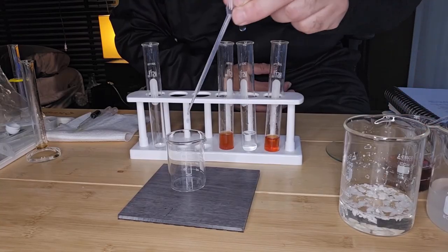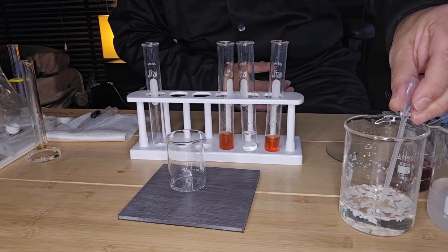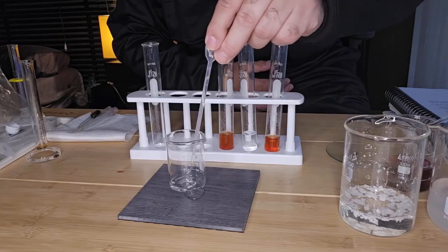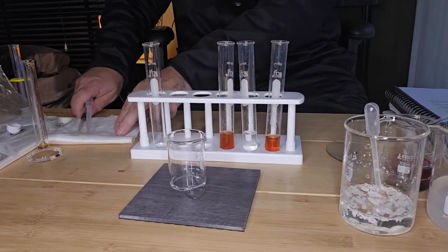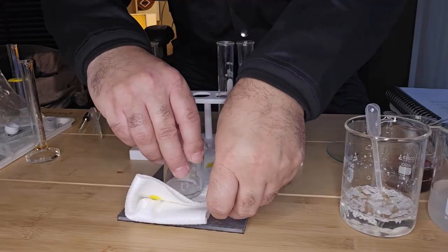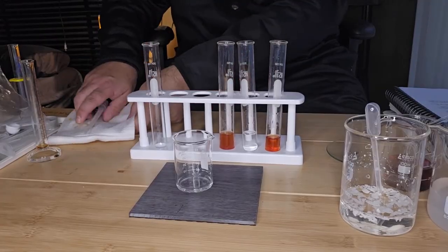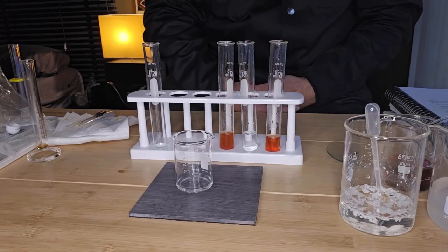So 1 ml, 2. And oops, I've spilled that. You don't want to incorporate any of the solid suspended particles that are left because, remember, they are a saturated solution. Okay, so I've added 2 mLs of calcium acetate to the beaker.